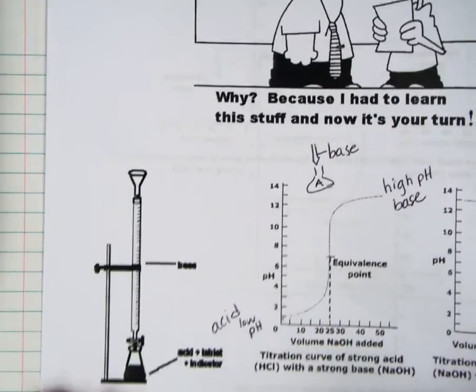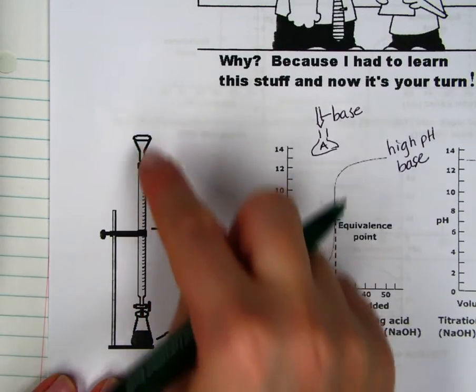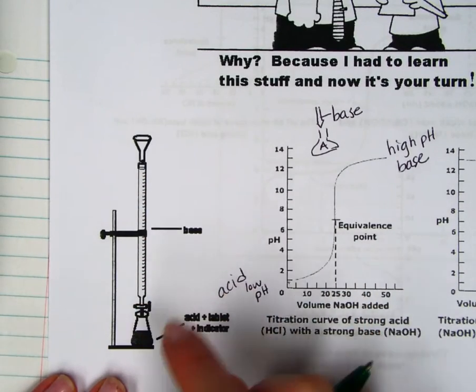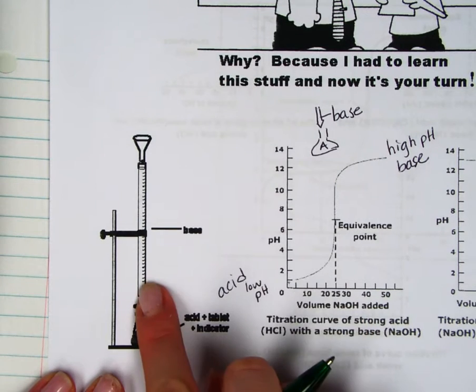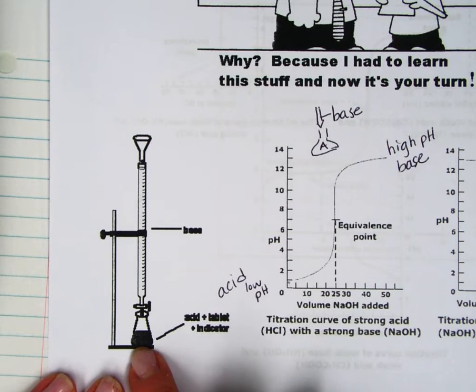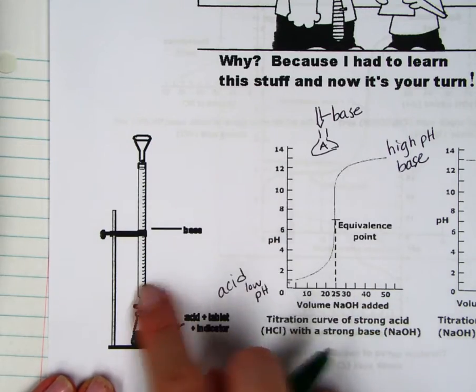So for example, if you look at the little diagram, the base would be in this contraption that would allow it to drop down into my Erlenmeyer flask. This is called a burette, and this is called an Erlenmeyer flask. So the acid would be in here, and this is where my pH probe is to find the acid, and then the base would be in my burette.